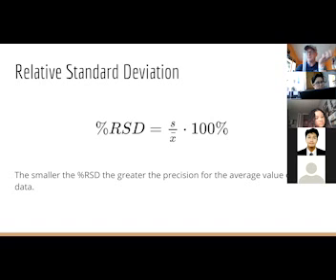That means it's a 10 mL graduated cylinder, and each tick mark is 0.2 mL. So there are also 50 tick marks on the cylinder. The relative error for both of these is probably the same, even though the error for the big one is going to be about 5 times greater than the error for the small one. But because we're measuring 5 times less, the relative difference is pretty much going to be exactly the same.